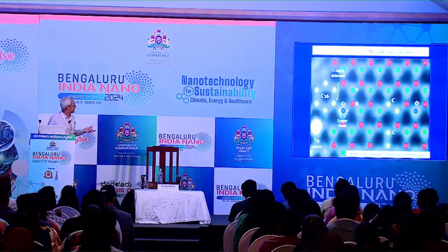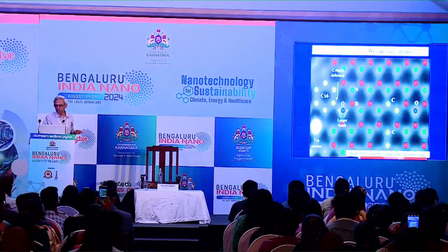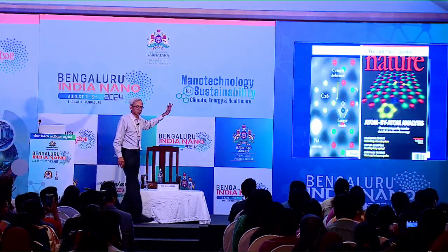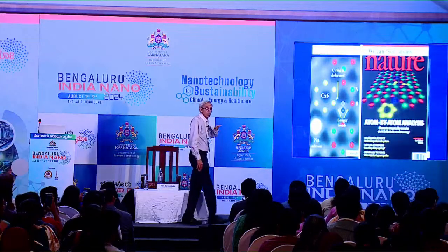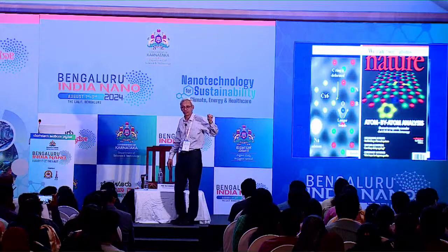Using STEM mode, this is something called boron nitride, and we have defects of carbon and sodium and so on. Again, this is Nature. All around a similar time, possibly slightly later, where you use a STEM mode to look at individual layers of boron nitride and show where carbon atoms are sitting, where nitrogen atoms are sitting.